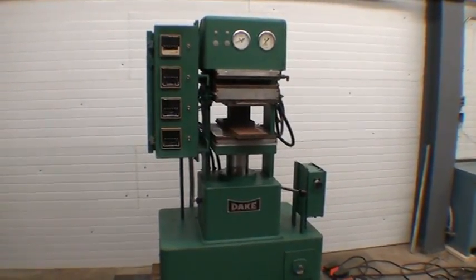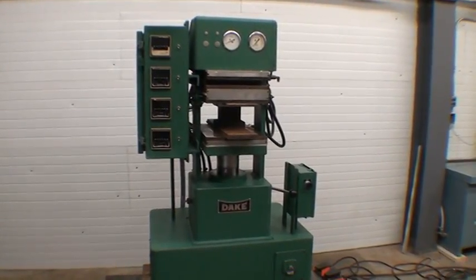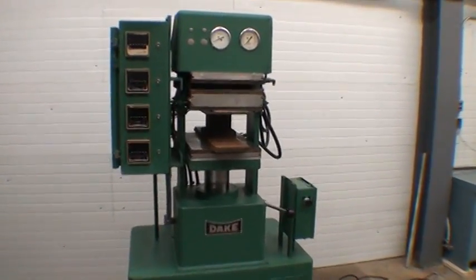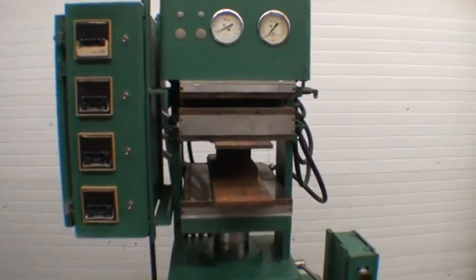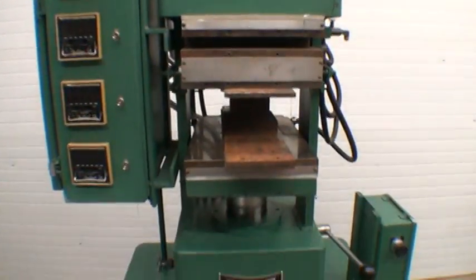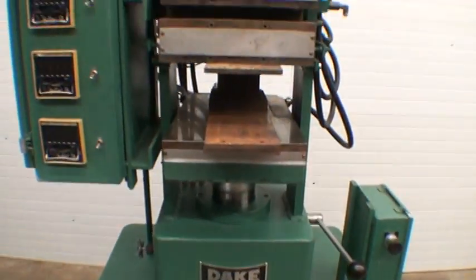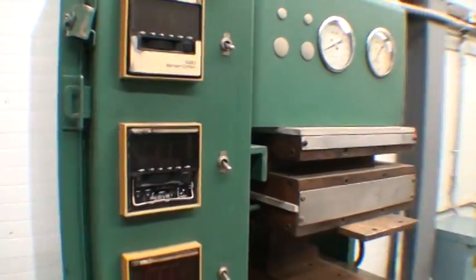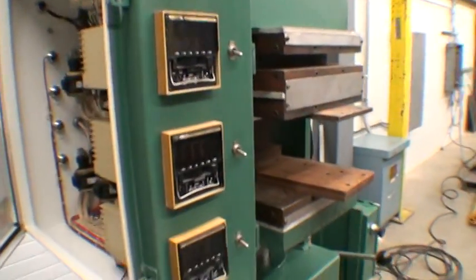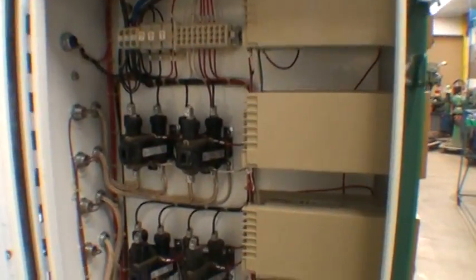Here we have a 50-ton Dake Multi-Platin Lab Press. Here are all the individual temperature controllers for all the zones. As you can see, it's very clean in here.